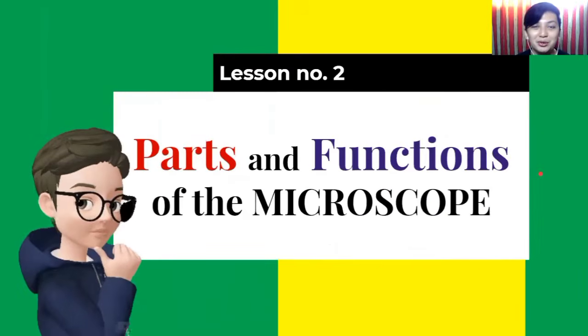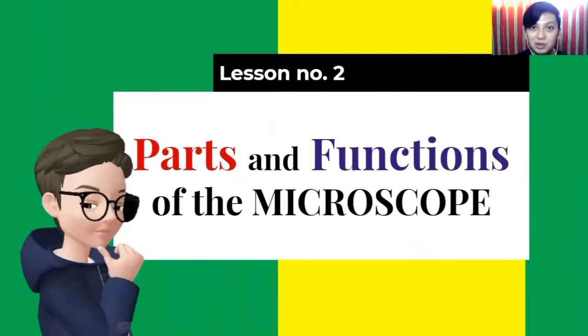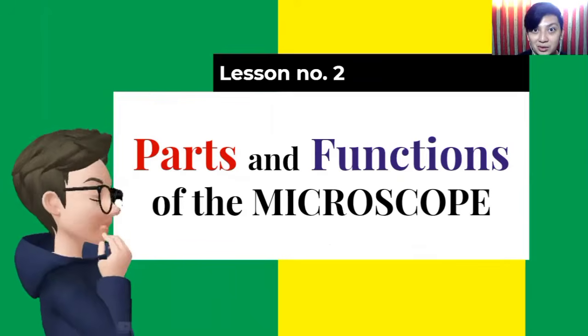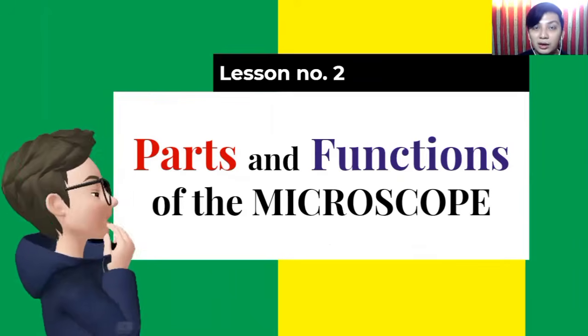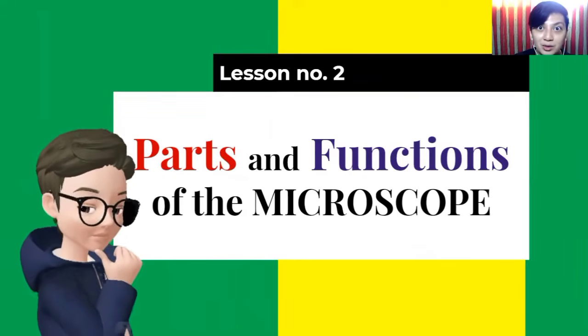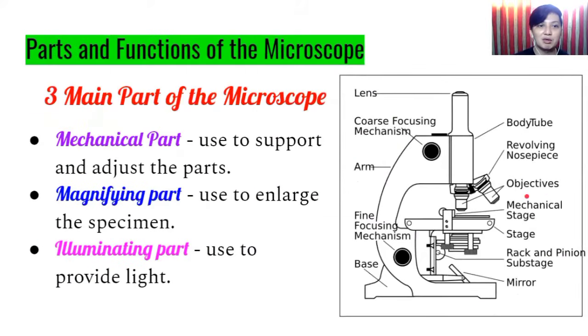So for lesson number 2, the parts and functions of the microscope, basically we are going to focus on the compound microscopes that are available in our school, and also that can be used with your own hands without the use of electricity. Okay, so let's start. So parts and functions of the microscope is divided into 3 main parts. We have the mechanical part, magnifying part, and then illuminating part.